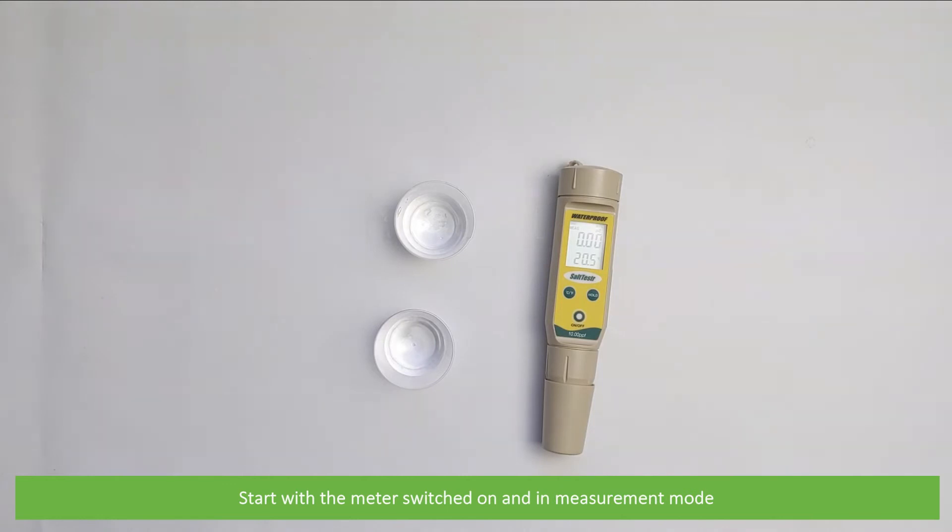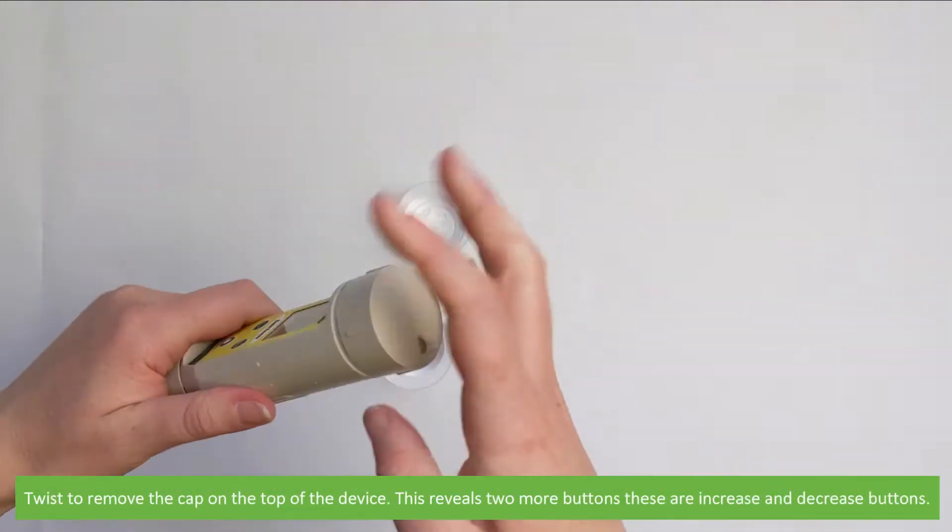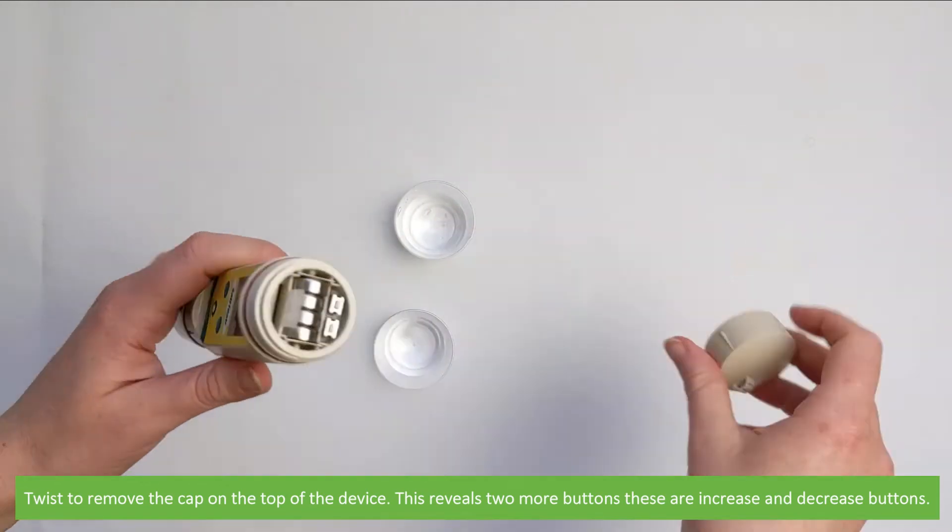Start with the meter switched on and in measurement mode. Twist to remove the cap on the top of the device. This reveals two more buttons, these are increase and decrease buttons.